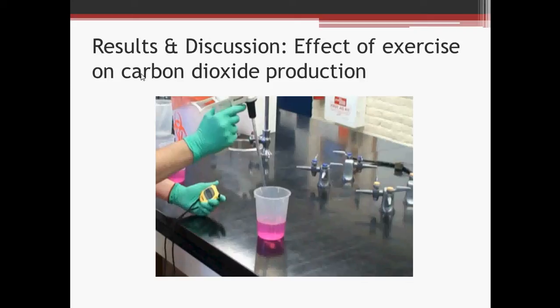clear. After the air had been bubbled through the beakers, ammonia solution was added dropwise to each beaker until the phenolphthalein became pink once again. The time it took for the phenolphthalein concentrate to turn clear was recorded, as was the number of drops of ammonia which turned the clear solution back to pink.